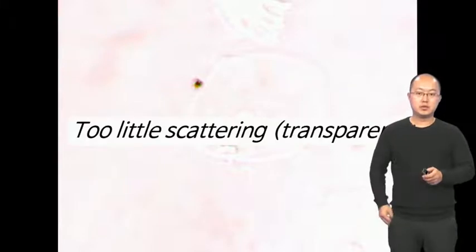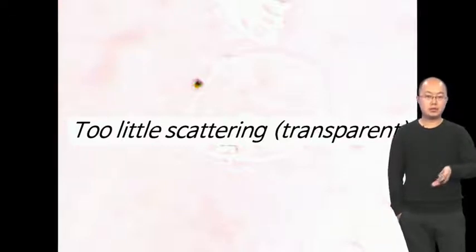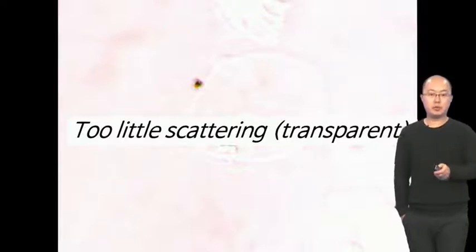So, I'd like to start talking about the challenges in bioimaging, especially the optical microscopy system for the study of cells and tissues. As you know, most biological cells are transparent because there is just too little scattering. If you think about the composition of a biological cell, it is mostly proteins and some carbohydrate, mostly water, and some lipid and nucleic acid. So those are all transparent in the visible wavelengths.